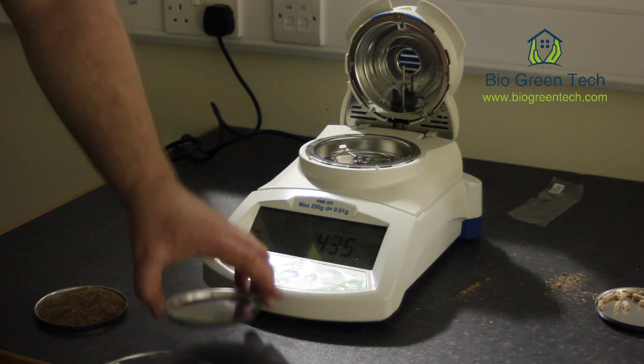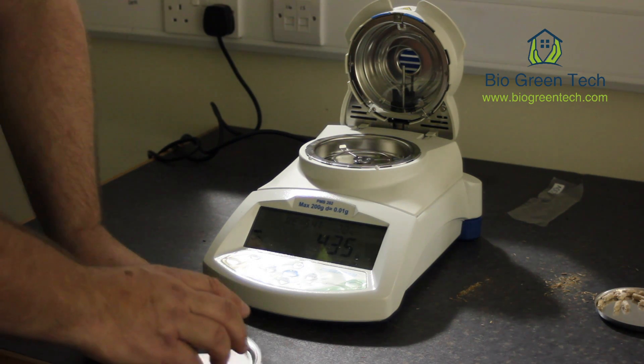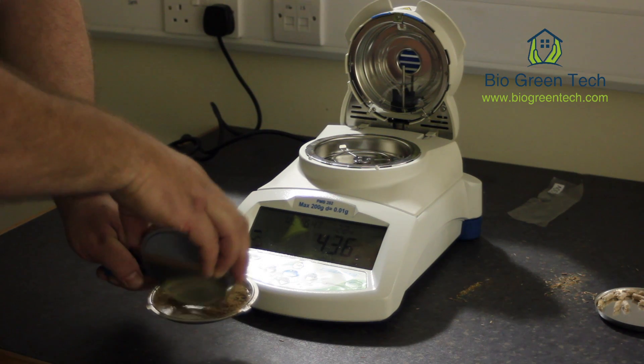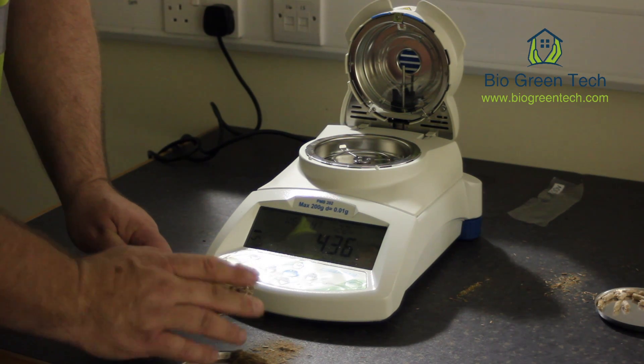That's been weighed now and zeroed, so we're going to put the material into the tray. It doesn't matter how much material we put in because it's going to weigh it again.